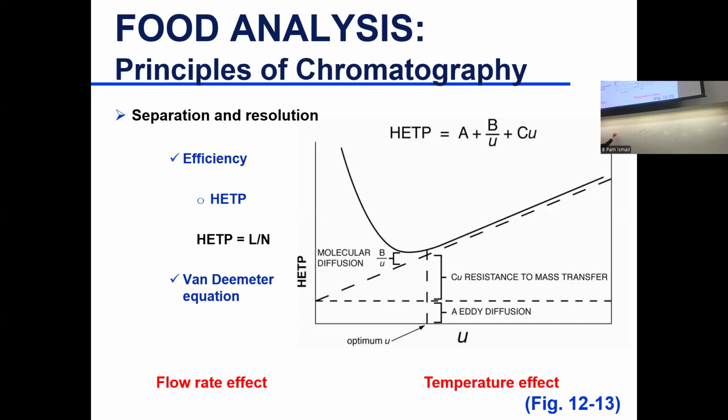So your mobile phase, the water, is going over small pebbles. Whereas when it comes here, there will be much more routes to go over.